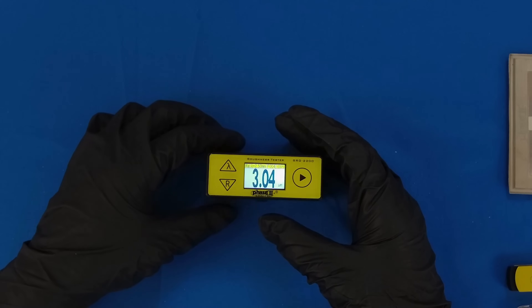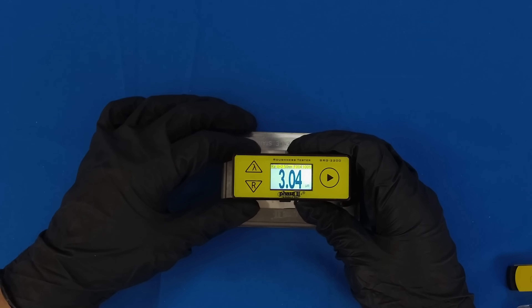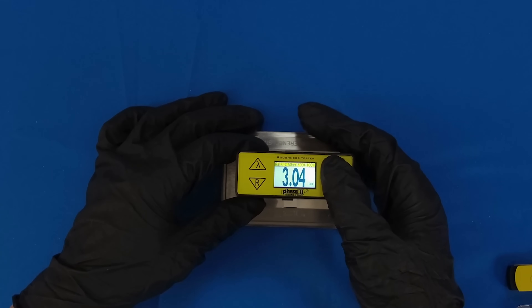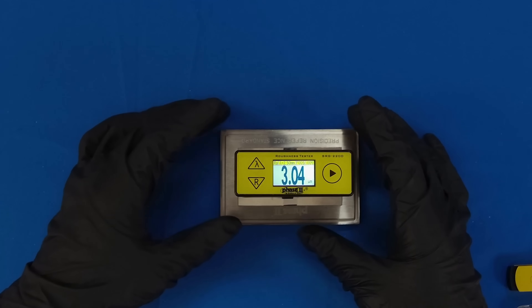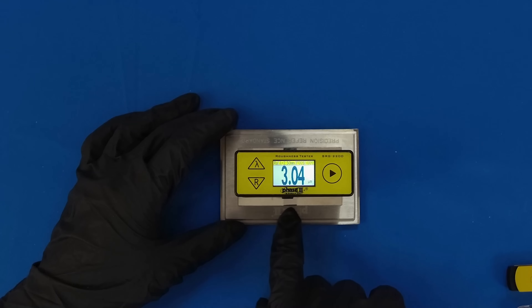You can toggle between inch and metric measurement by holding the Lambda button for two seconds. To take a test, first position the unit over the area to be tested. Once the stylus is centered, press the start button to begin. You may have noticed that a number was displayed on the screen — this number is the result. However, do not move or disturb the unit before the display blinks twice, as the stylus is still in the process of returning to its home position.